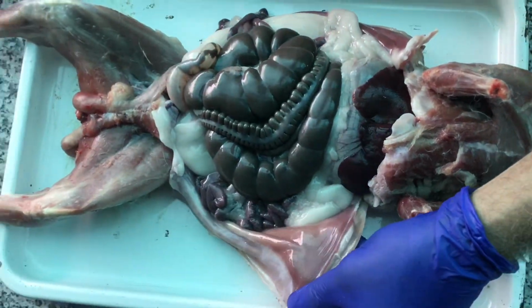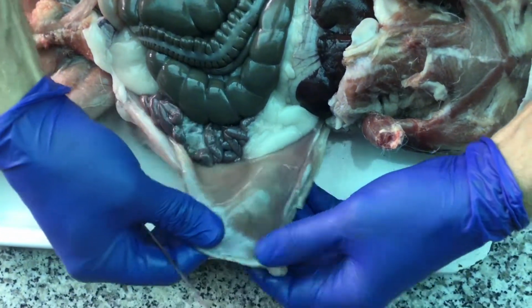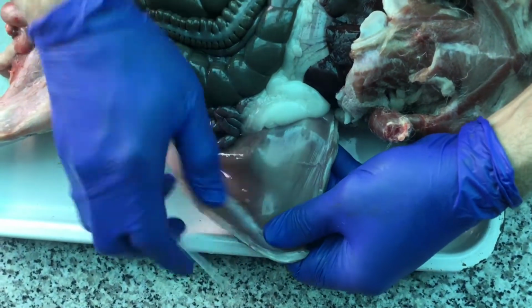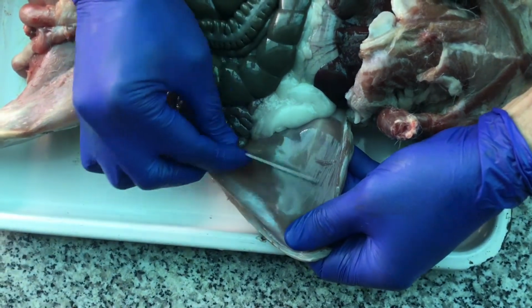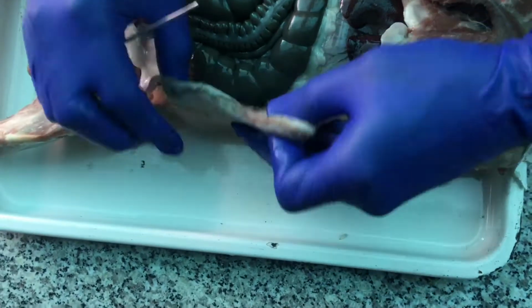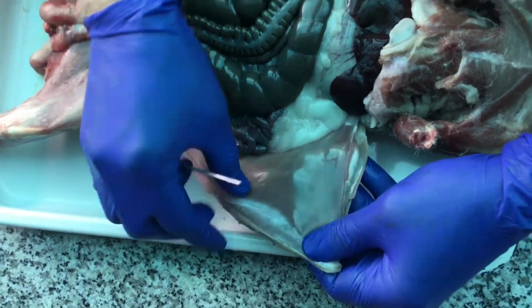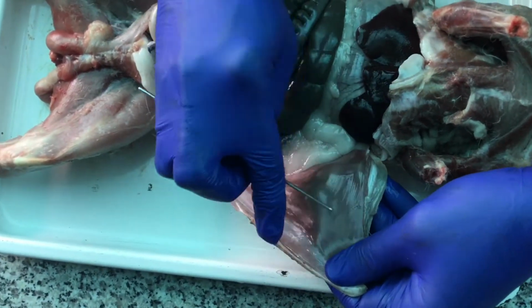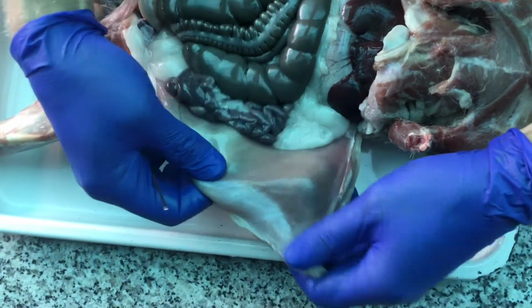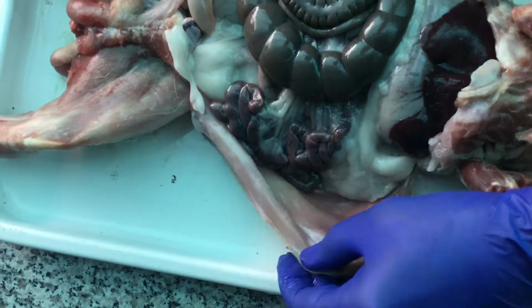And again, there you can see coming up off that internal abdominal muscle, the thin saran wrap-like lining is going to be the parietal peritoneum that wraps on the inner surface of the outer or parietal part of the body. And it's pretty tightly adhered. If it were a younger rabbit, I might be able to get it off, but you can see that nice sheeny layer that's on there on either side.